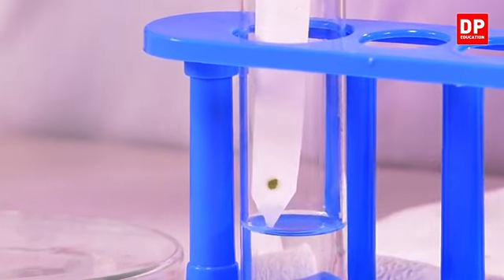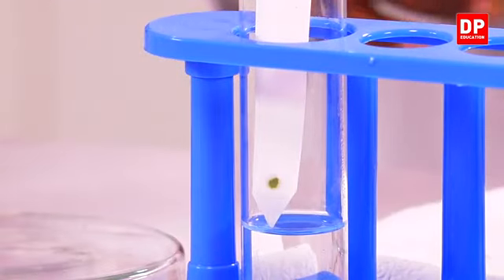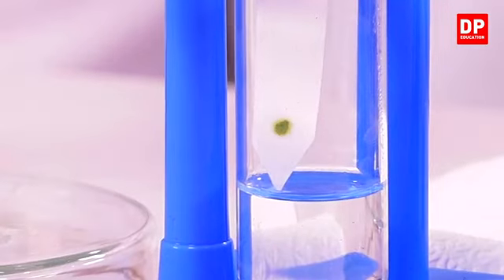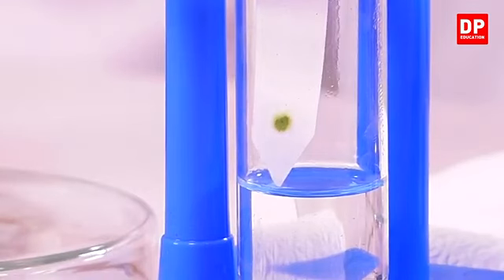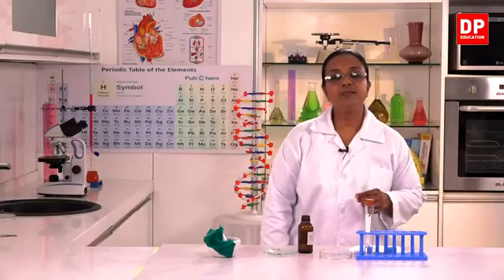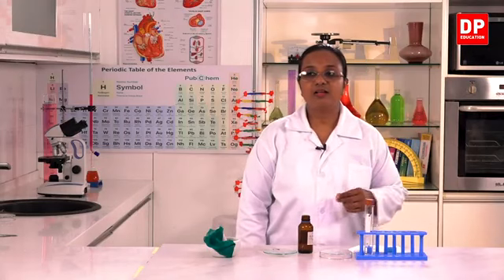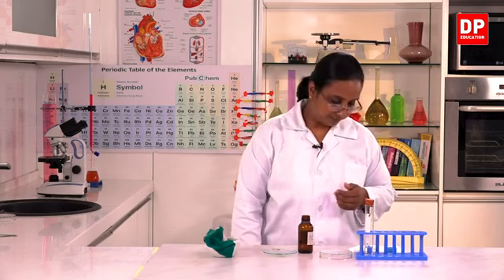Now the tip of the paper is in contact with the acetone solvent, and you can see the solvent rising along the chromatography paper. With the solvent, the pigments present in this chlorophyll extract will also rise along the paper.